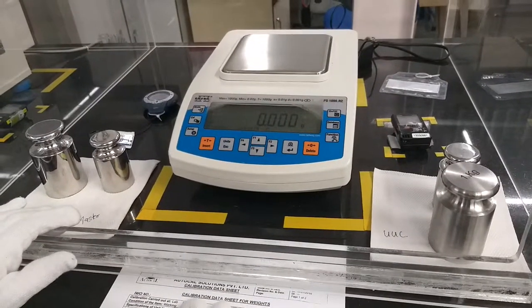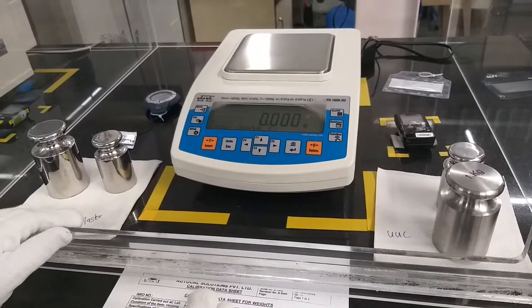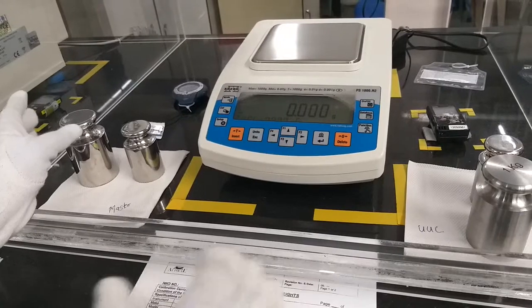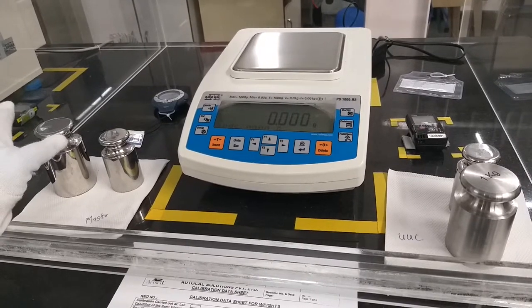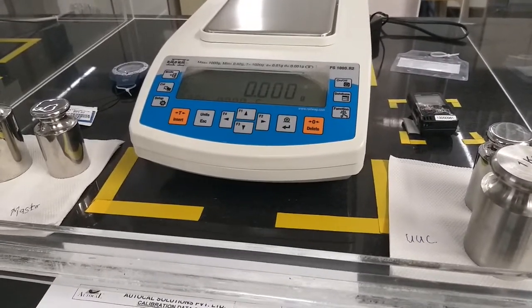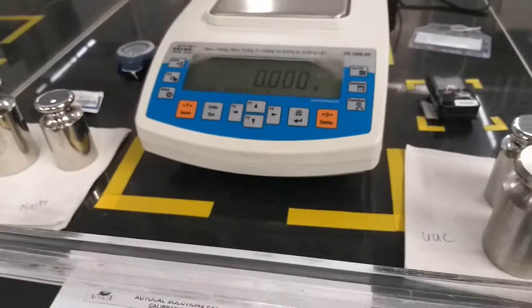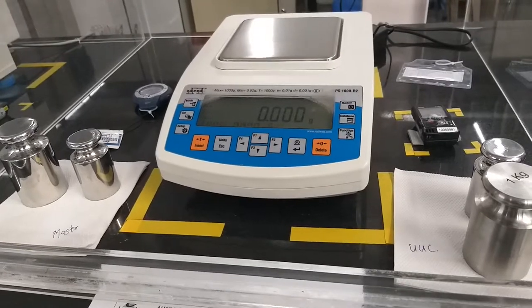Today we are going to calibrate weights — 1 kg and 500 grams. The masters we are using for calibration is E2 plus, which we have in our lab. The balance we are going to use for calibration has a range of 20 mg to 1000 grams, and a resolution of 0.001 grams. This is the best resolution balance we have in our lab for calibrating 1 kg weights.